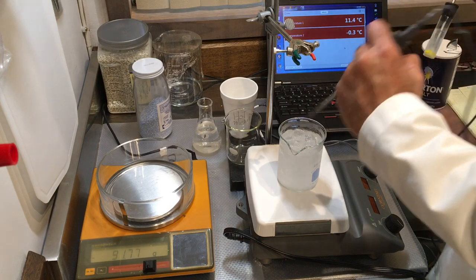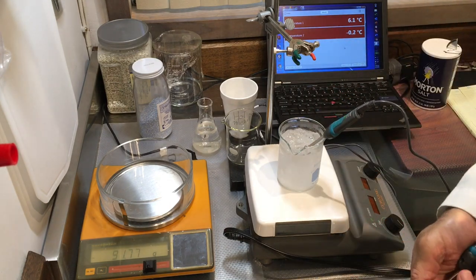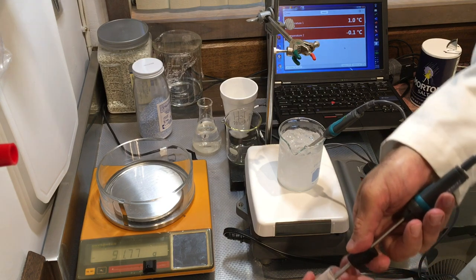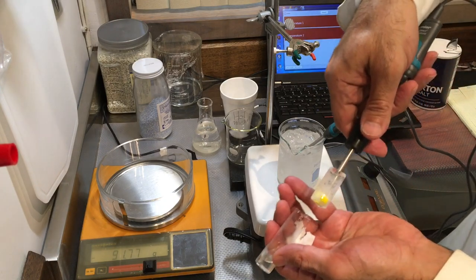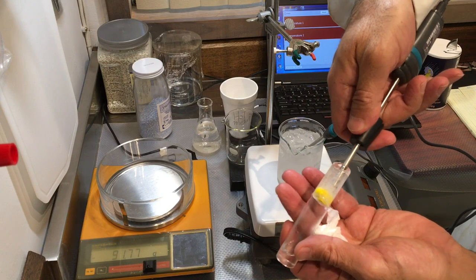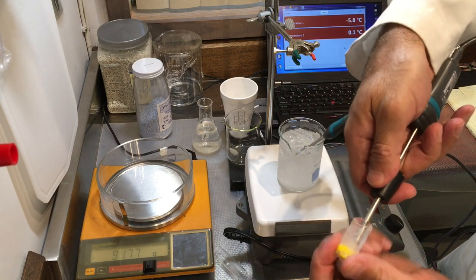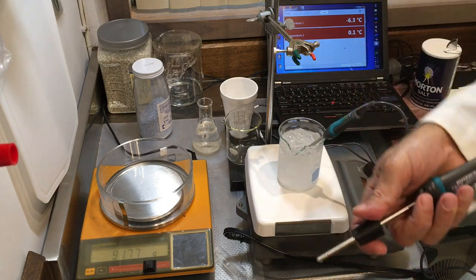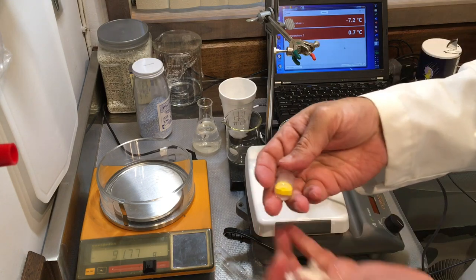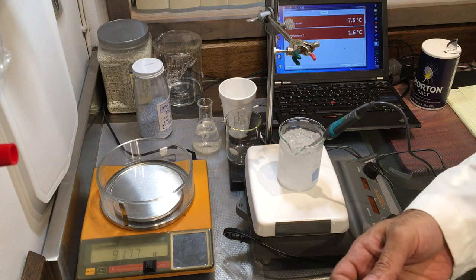I'll continue to monitor the ice bath temperature. You can see the piece of ice — it's pretty cool, taking the shape of my test tube. I need to get this out; I think I'll break it off or put some water over it.